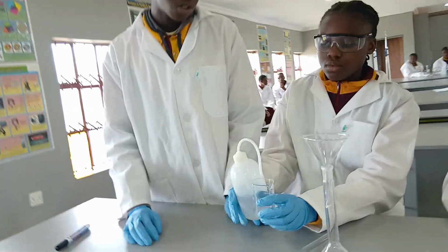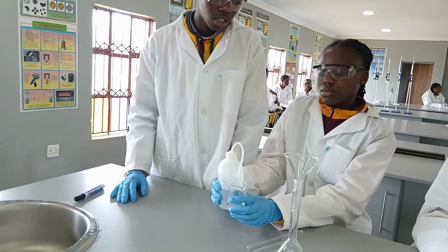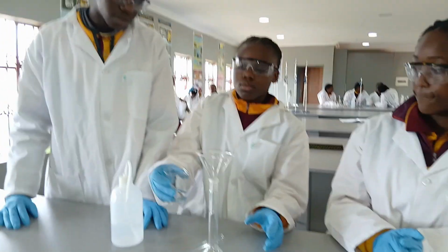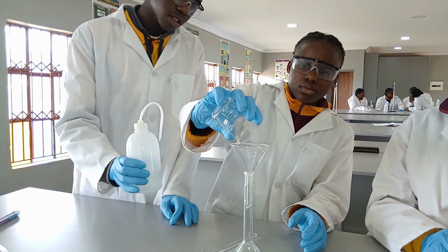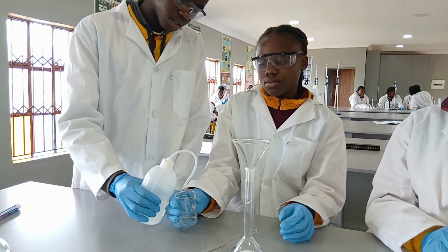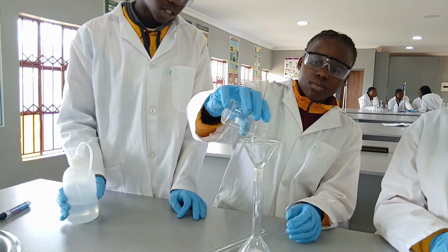So we quantitatively add to our volumetric flask as we wash it. Rinse again.